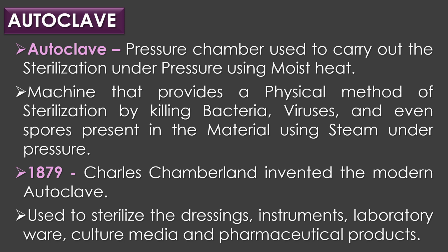Charles Chamberland invented the modern autoclave in 1879. He worked under Louis Pasteur and created this device to support Pasteur's studies in microbiology. Autoclave is used to sterilize dressings, instruments, laboratory ware, culture media, and pharmaceutical products.